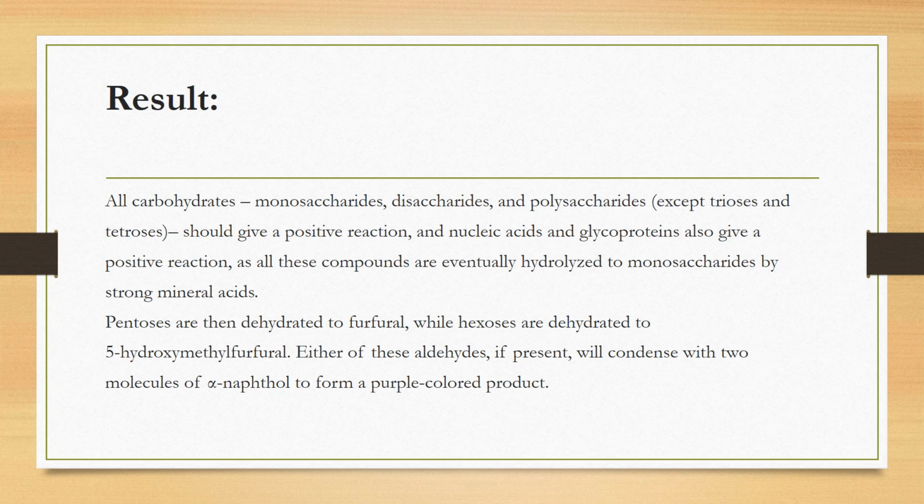Either of these aldehydes, if present, will condense with two molecules of alpha-naphthol to form a purple colored product.